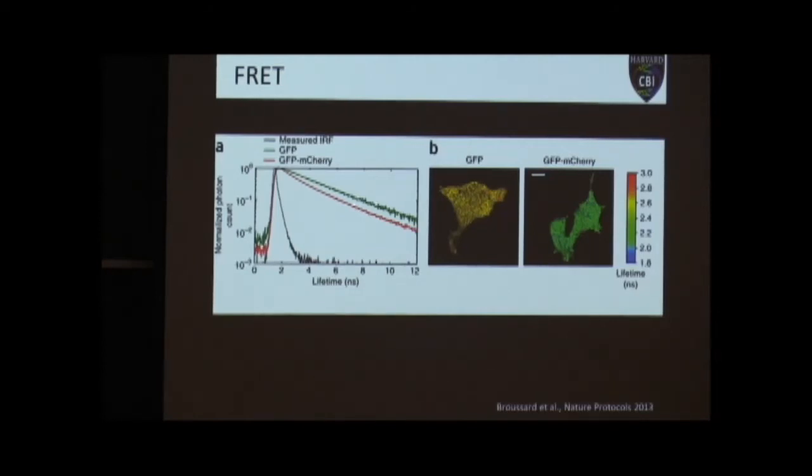This is what you see. It's just this characteristic shift. If you're looking at exponential decays, it's a shift to the left. When you're looking at linear, it's more of a shift sort of down to the left. This little black line here, something I haven't talked about yet.